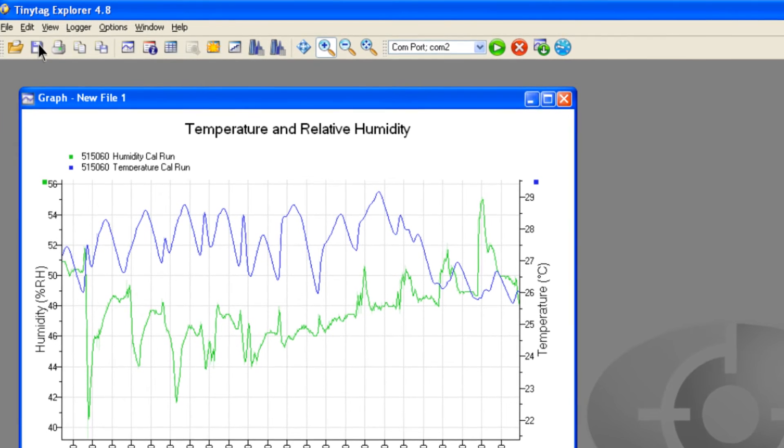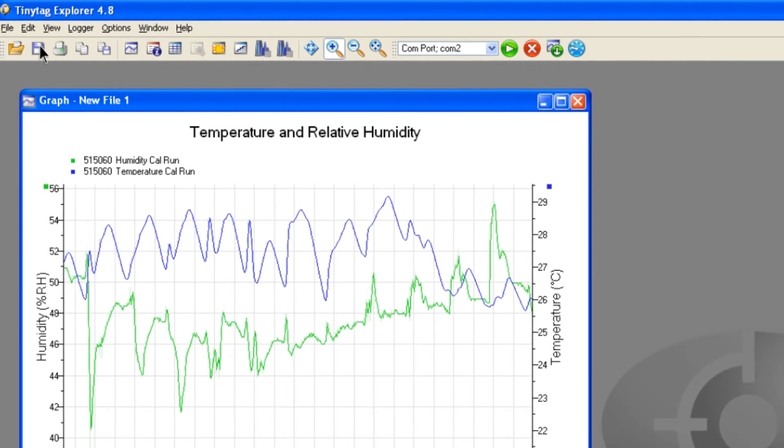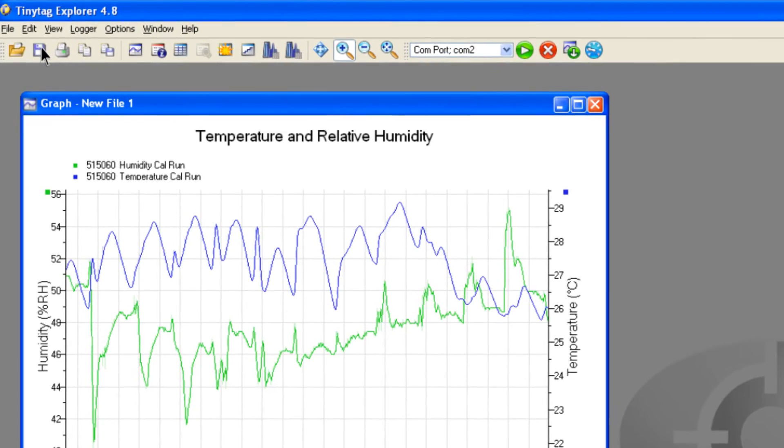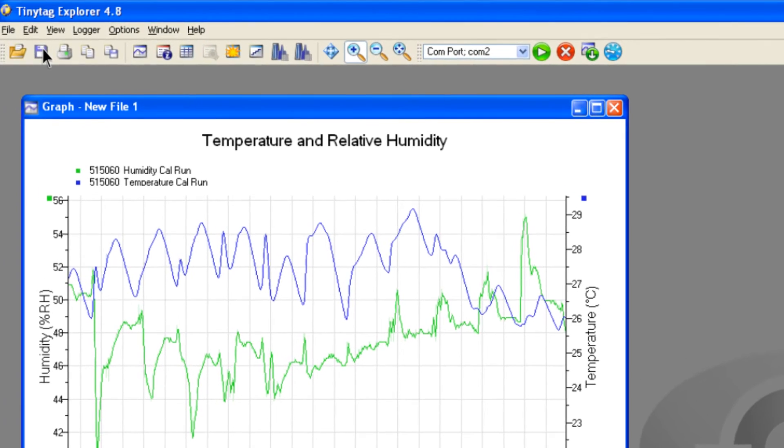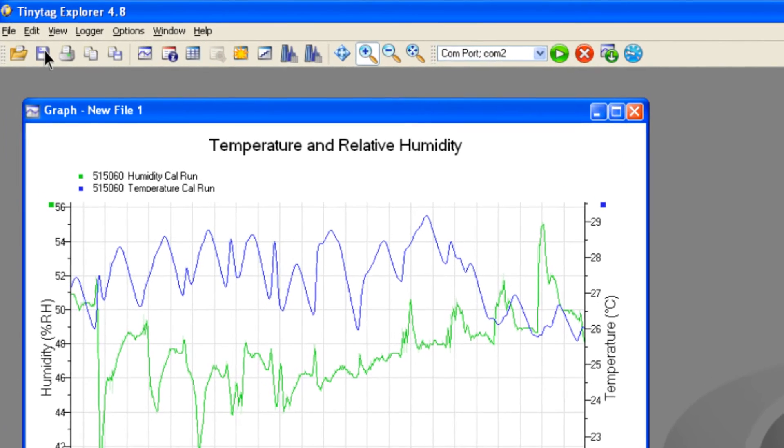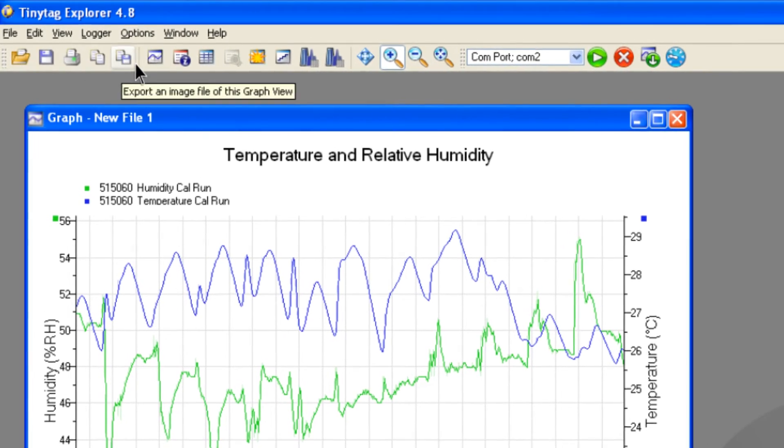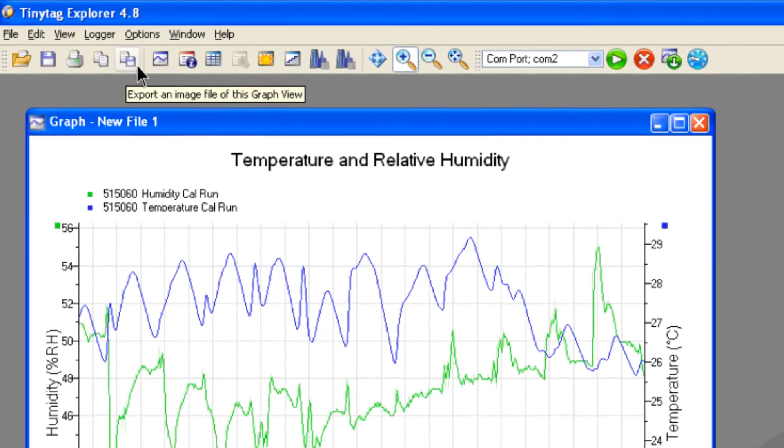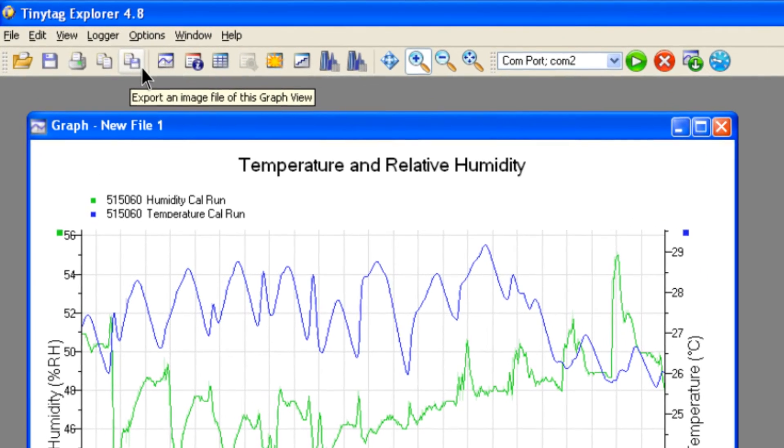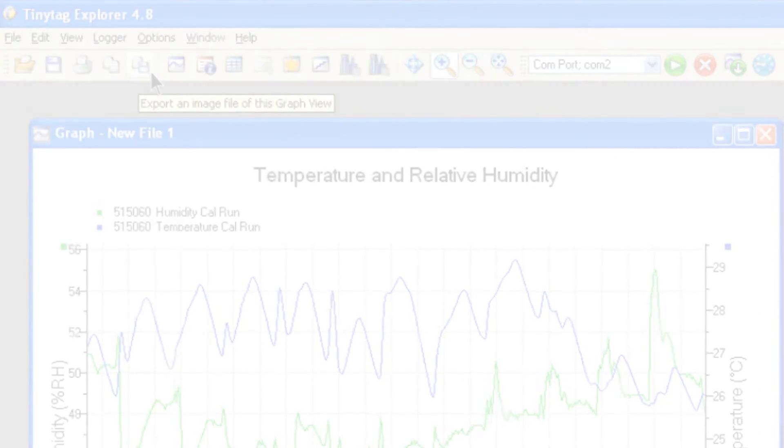The data downloaded from each logger can be saved to your computer by clicking on the save icon. Data can also be exported as a file in various formats or by using copy and paste for use in other programs.